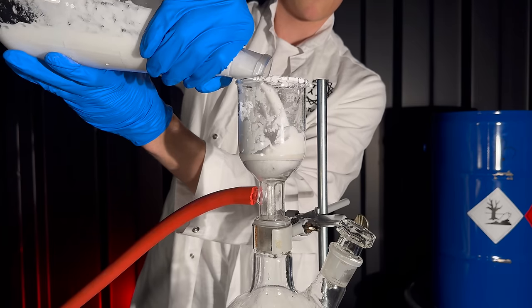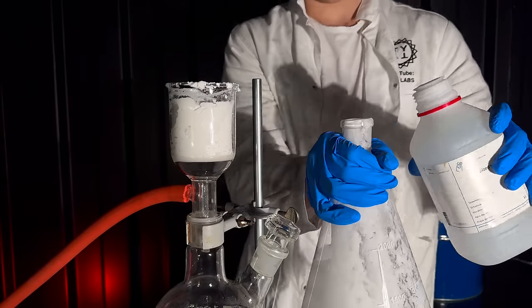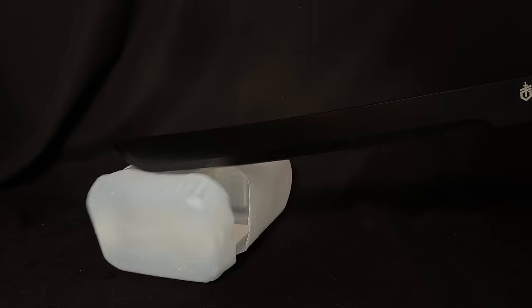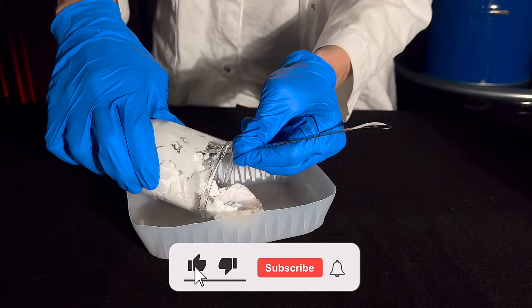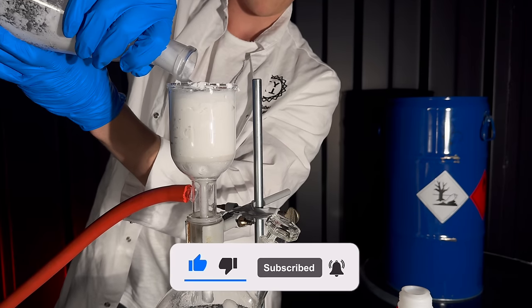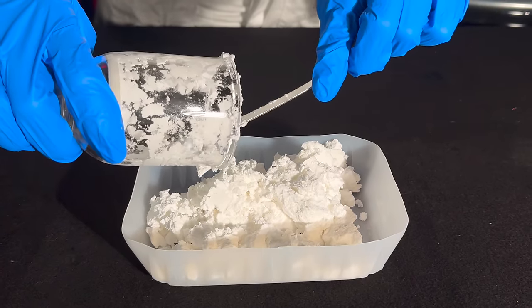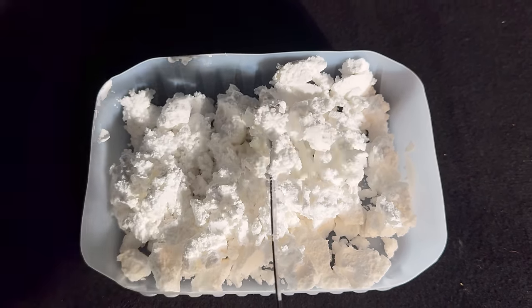Again, the trusted vacuum filtration is the best way to remove any liquid. I quickly rinsed the filter cake with distilled water before scraping it onto a highly specialized laboratory tray that was made by cutting open a canister. I used a small filter and eventually it's going to be full. After emptying it, I therefore repeated the same process. There you go, some of world's finest powder with a little bit of dihydrogen monoxide contamination.